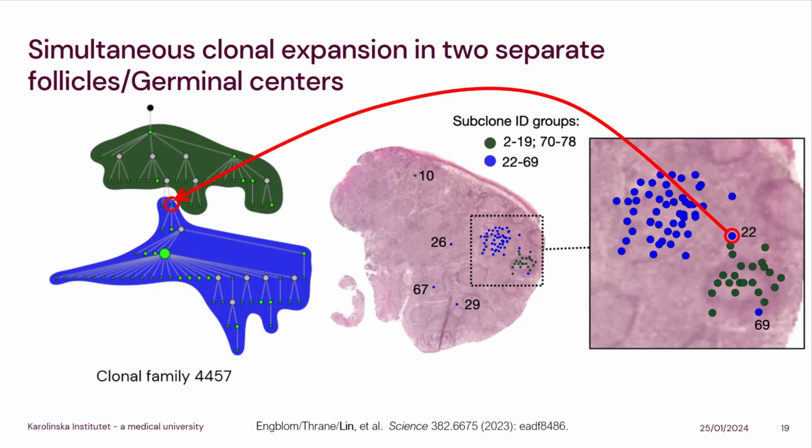Another one here, 69, is this dot. It's more associated with the previous lineage instead of this one. So this is a very exciting discovery for us. So we also did other research.